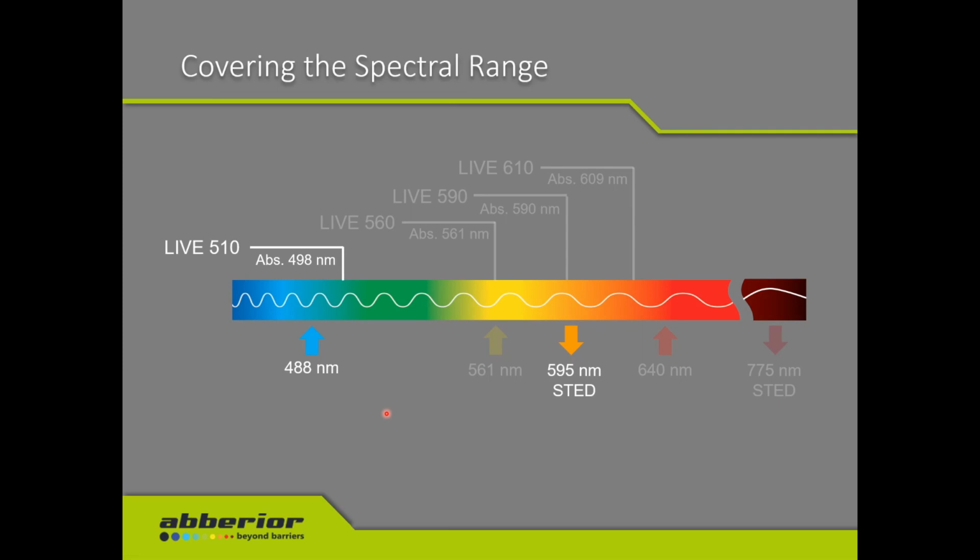With this, we can now cover quite the full range of our spectra. So, for example, with the very commonly used 488 nanometer excitation laser, we can use a Live 510, for example, which is also usable for STED microscopy when we use the 595 nanometer STED laser.